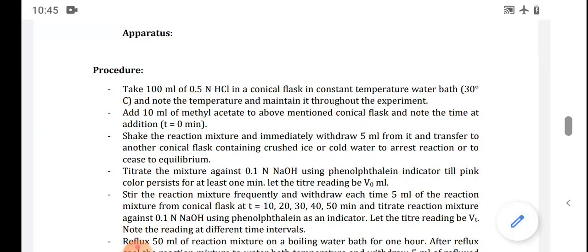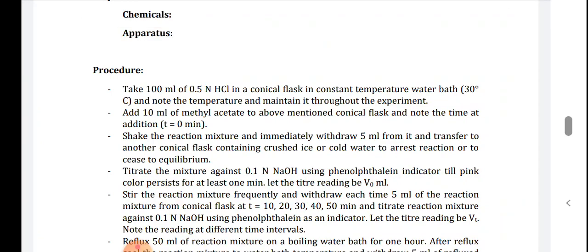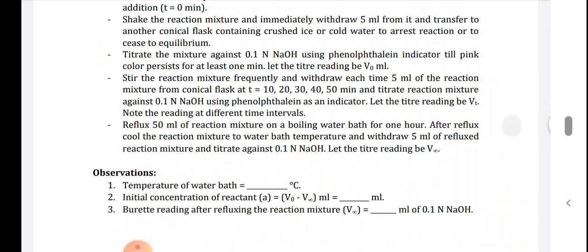Start stirring the reaction mixture frequently and withdraw 5 ml of the reaction mixture at 10, 20, 30, 40, and 50 minutes. Titrate each against 0.1 normal sodium hydroxide using phenolphthalein as an indicator. Let the titration reading be Vt. Note all readings at different time intervals and record them in the observation table.